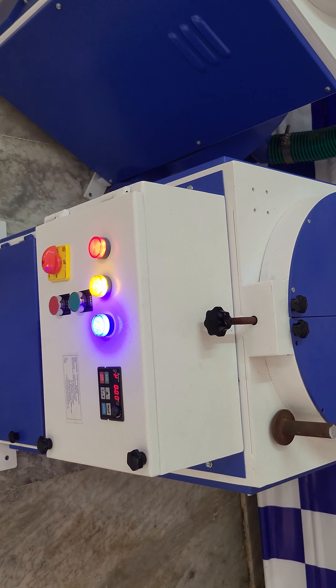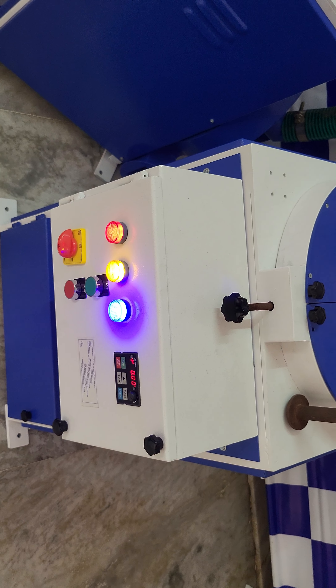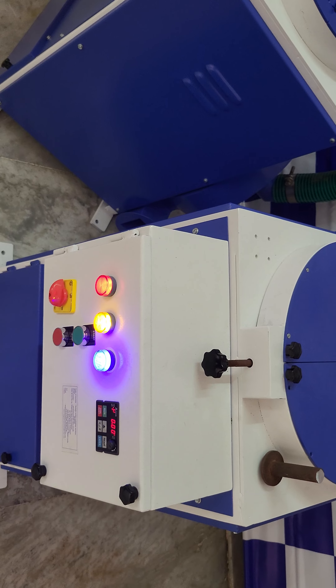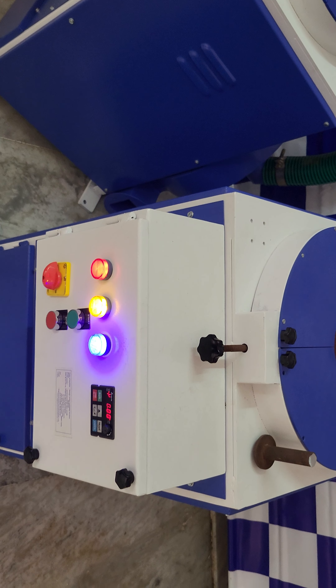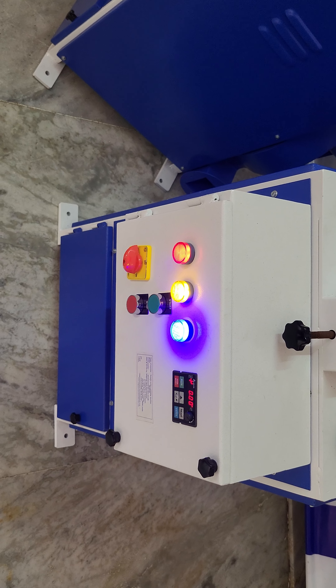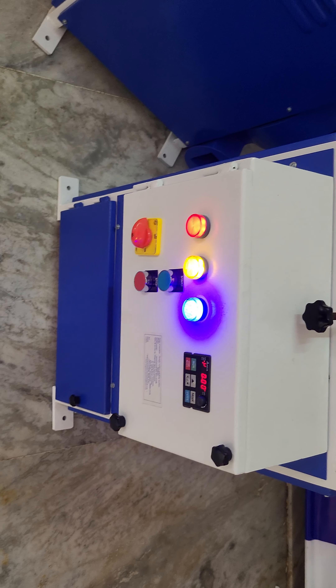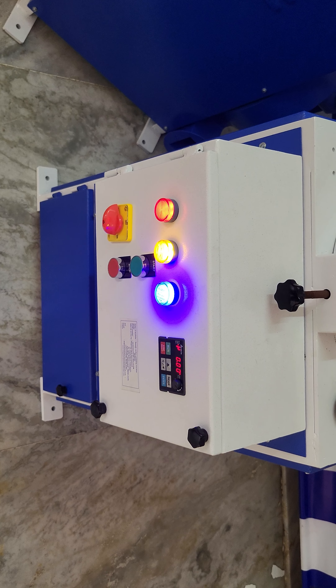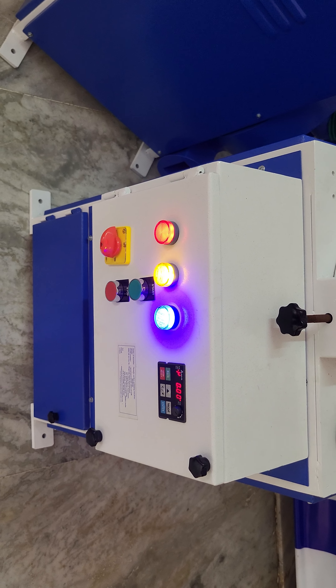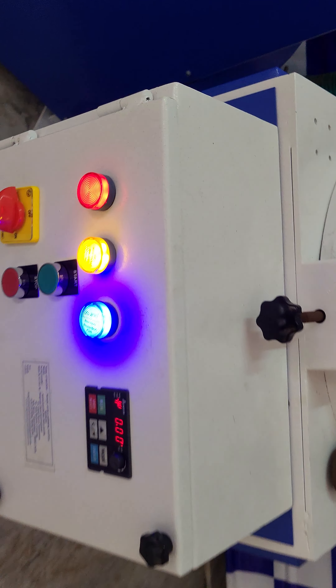In the variable speed machine, the motor specification is almost the same — only the star and delta configuration of the wiring changes. It is a 3-phase 2 HP motor with variable speed; 3000 RPM is the maximum. We are using a Delta MSP 300 drive to vary the speed.